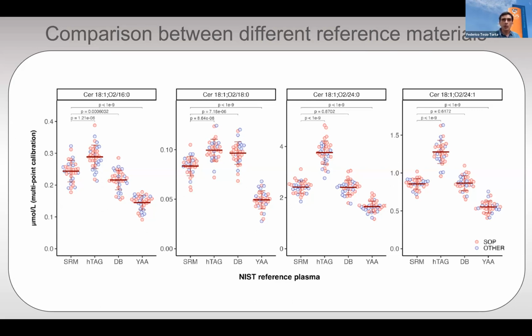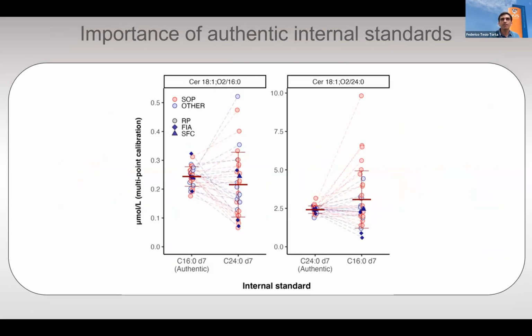Although I think we really have to appreciate the efforts that NIST is putting in supporting the lipidomic and the metabolomic researchers and generating this new set of samples that will be very important for estimating the effect of different types of matrices, especially for this kind of application.